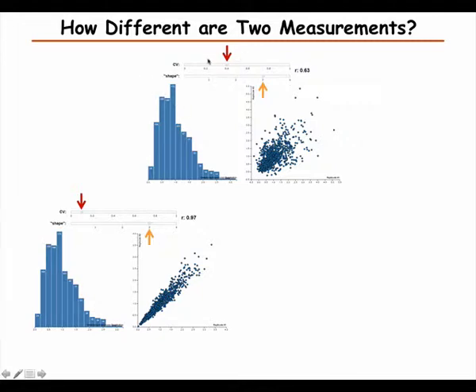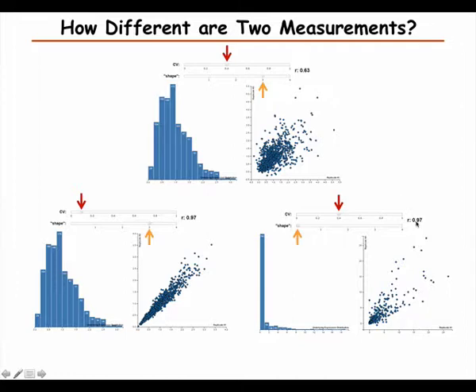But even if we keep the CV at 0.4 and now instead make the distribution more skewed, we can improve. So now the quality of the data is the same. The coefficient of variation is still 0.4, but now we have made this distribution very skewed. So we have most of the points here, but we have some outliers. Then we can get a correlation coefficient of 0.97 again.